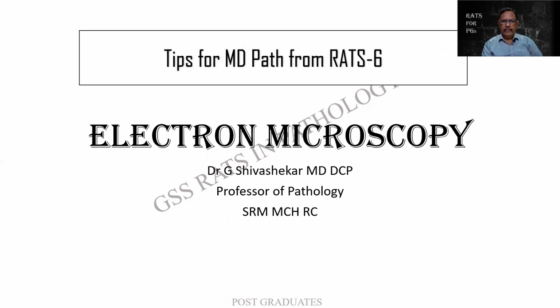And look at the screen. You have got the electron microscopy. From this, the question shall be electron microscopy as such, applications of electron microscopy, transmission electron microscopy, scanning electron microscope, the applications of electron microscopy in renal lesions, in dermatopathology, or in other conditions as well.